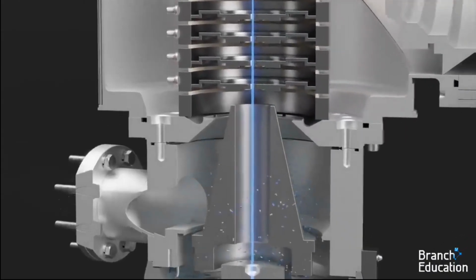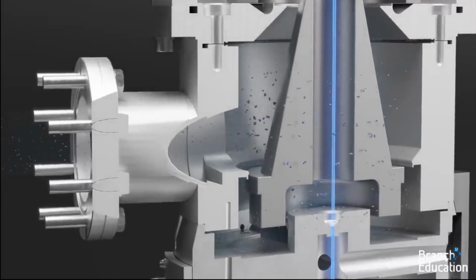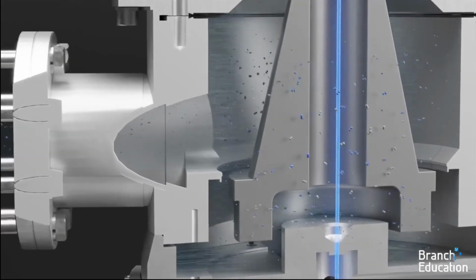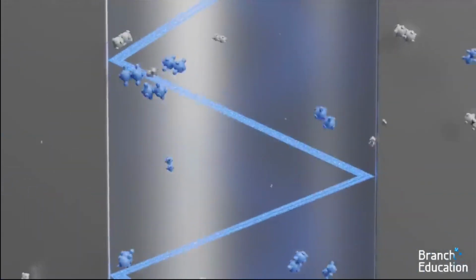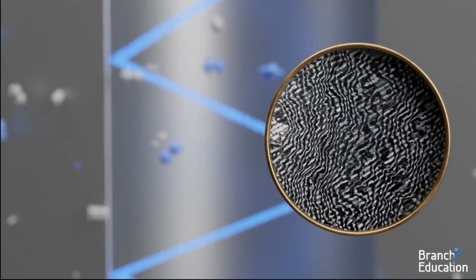One important detail is that when the microscope is running and electrons are being accelerated to relativistic speeds, vacuum pumps are used to remove all the atmospheric molecules, thus creating a vacuum similar to the vacuum of outer space. This is because incredibly fast-moving electrons will scatter in random directions as they collide with air molecules and thus ruin the images of the specimen.